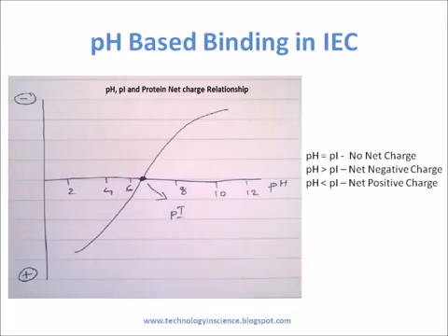pH-based mechanism. Separation of molecules by ion exchange chromatography relies on differences between the net surface charges on the solute molecules. Proteins, for example, contain numerous groups which can ionize to varying extents depending on the pH of the solution. The ionic state of these groups is highly dependent on the pH, and as a result, the net surface charge of a protein will undergo a change as the pH of their environment varies.